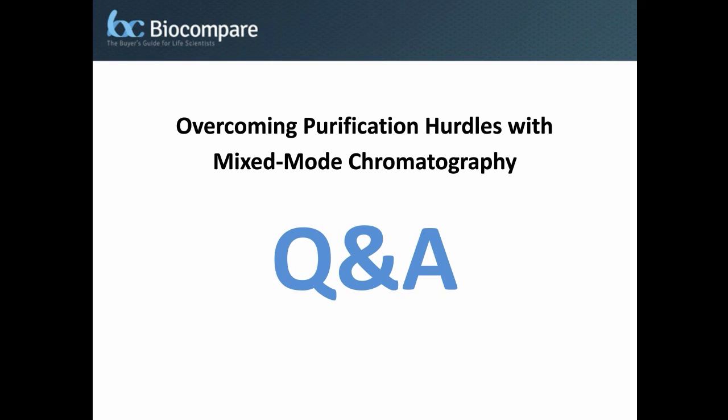They all affect proteins differentially on C prime, meaning that they will affect a particular protein in different ways on C prime itself, and if you compare C prime to other mixed mode resins, they will differentially affect the behavior of a particular protein on C prime compared to that same protein on another resin. So again, if you're looking to do some really fine separations and C prime itself isn't giving you what you need, you might try the suite of mobile phase modifiers that are probably in everybody's toolbox.